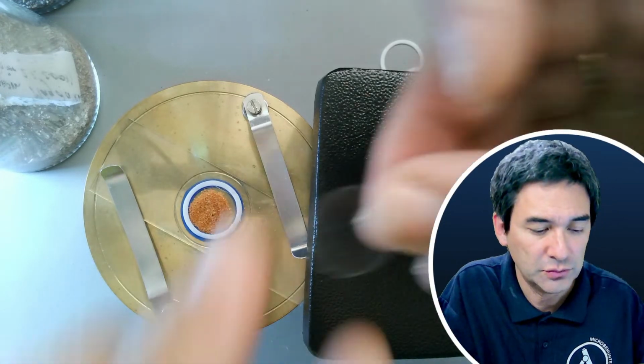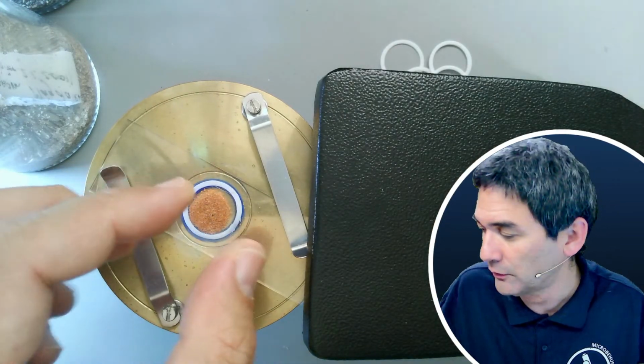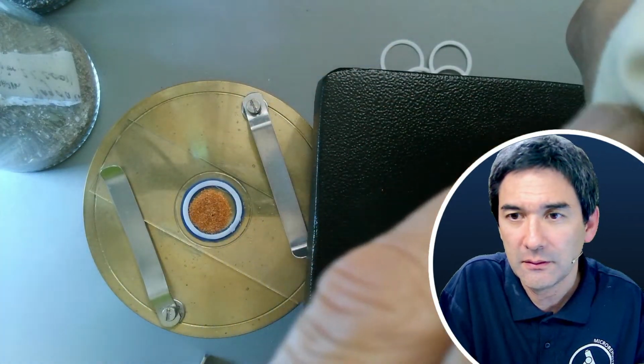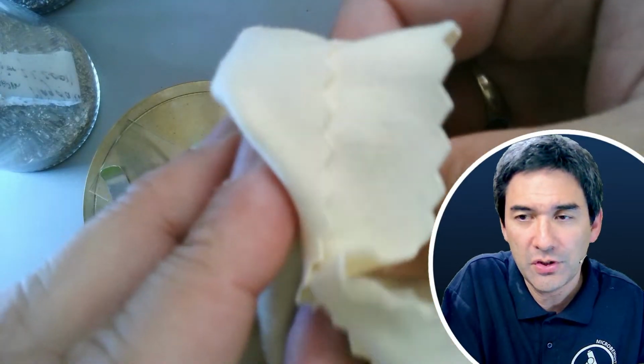Okay, so here we go. This is a round cover glass, 18 millimeters. It should fit exactly on top here. I always dry wipe it first.